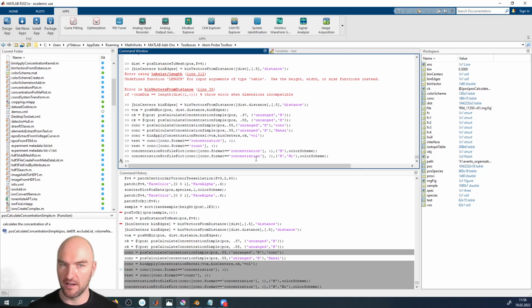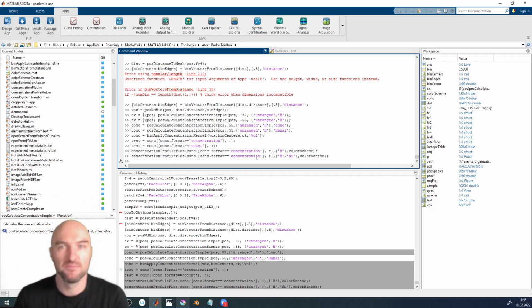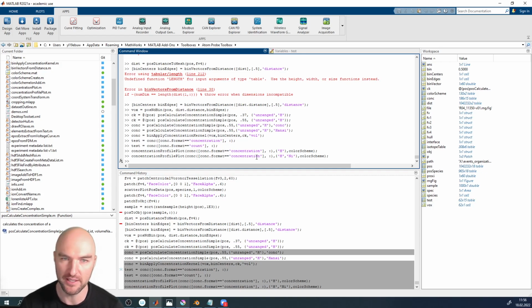Okay, so this was a proxigram, and now we want to move on to ND analysis. So we might want to go and do a voxelization based on that. Because in this case, we can apply any function we want in 3D to our voxelization. So you can do a charge state ratio voxelization. You can do a voxelization where you need to have some collective information about the atoms in the voxel, not just counting what atom it is, but calculating some statistics, calculating whatever information you want.